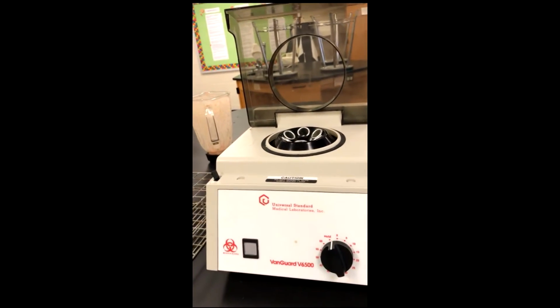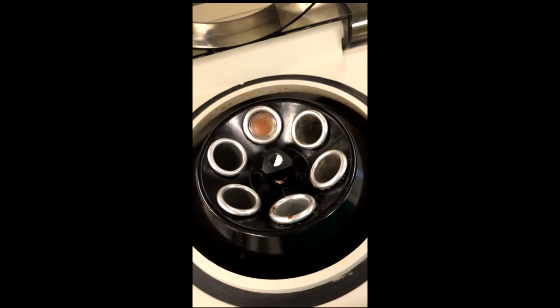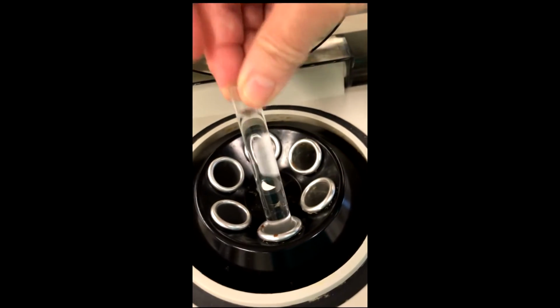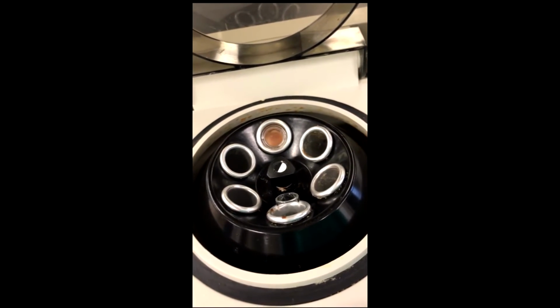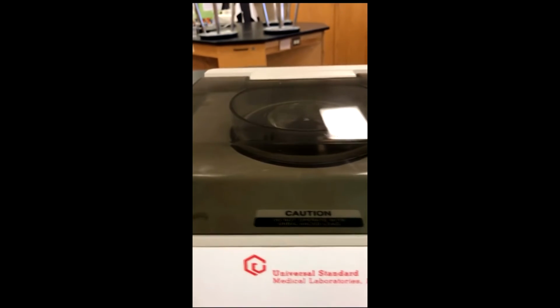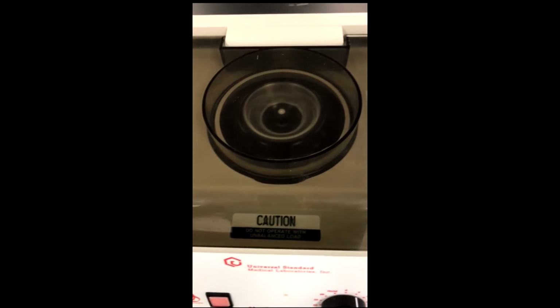So this is what the centrifuge looks like on top. So I'm going to put the hot dog down one tube, and then for the sake of balance, I'm going to put a test tube that contains water in the opposite tube, and that way when it spins, it won't be off balance. So then I'm going to close this up. Whoops, and turn it on. And I'm gonna let it spin for another 5 or 6 minutes.